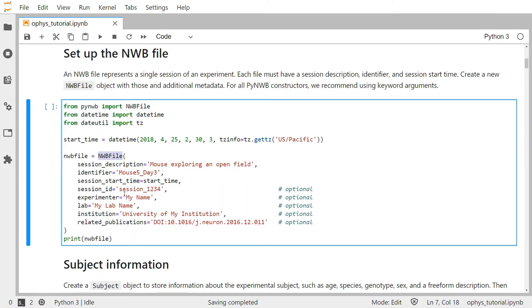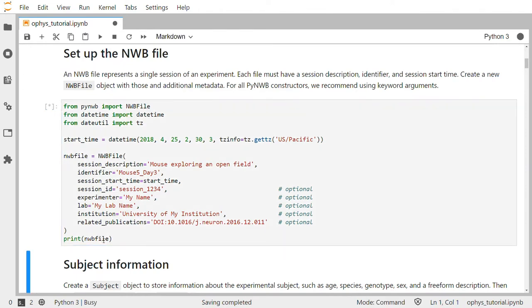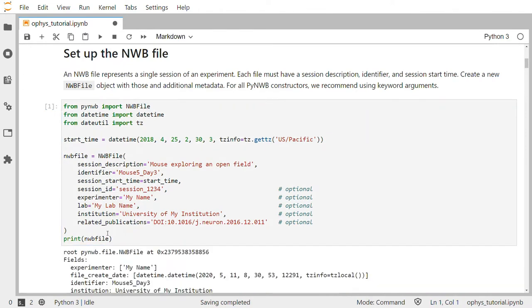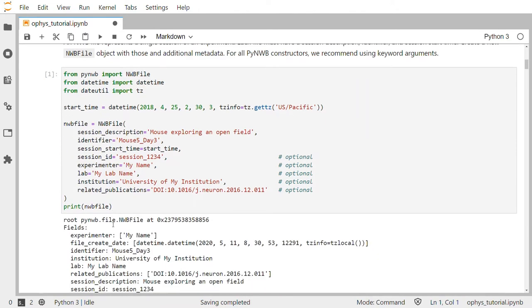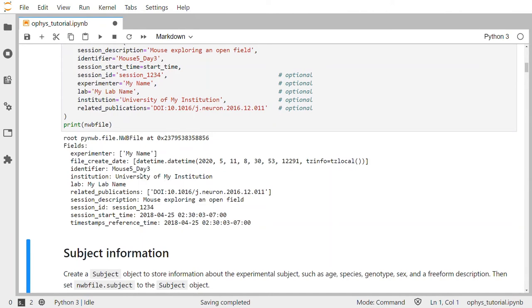We can print the NWB file object by simply calling print on the variable, and then you can see the information that we've entered into the NWB file printed out here.